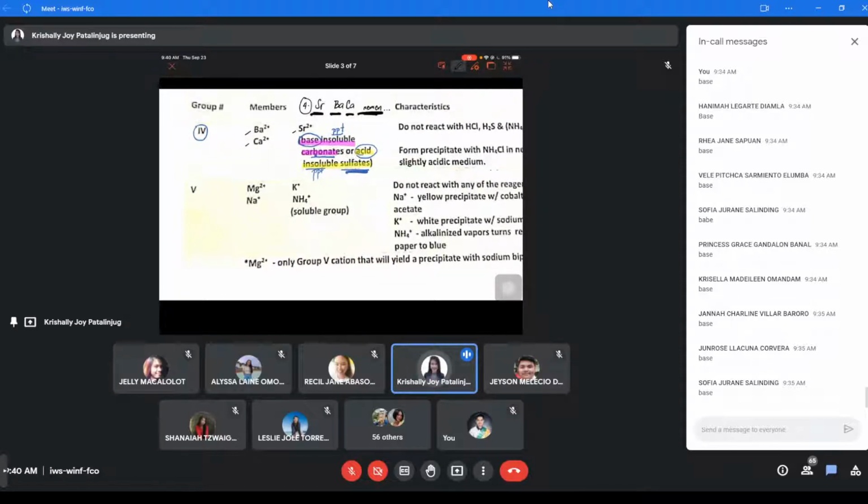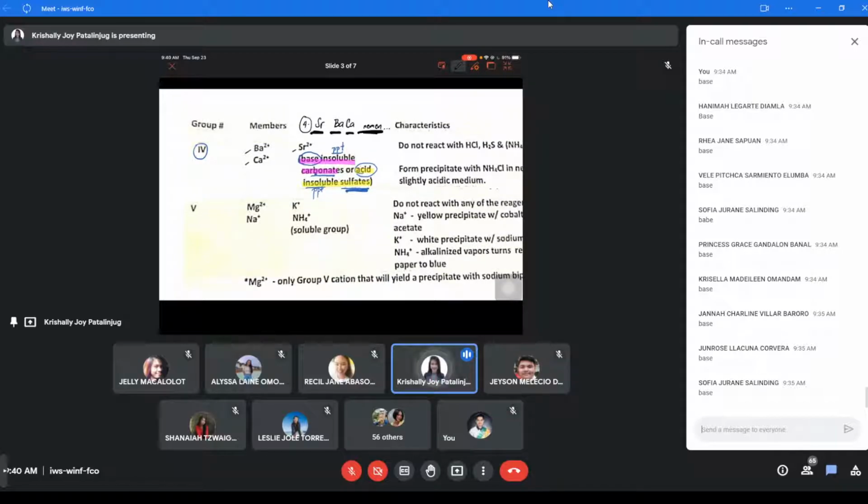So, mga example, ayun na. Okay? So, halimbawa na lang ng mga carbonates, you could have ammonium carbonate. Sa sulfate, pwede din naman ammonium sulfate or sulfuric acid. Okay? Sulfuric acid alone, pwede. As long as may sulfate, you can extract sulfate from that solution. Kasi 'di ba, sulfuric acid alone, may sulfate ka na, acidic na siya. Acidic na siya in the first place.